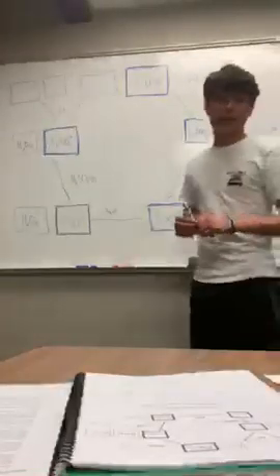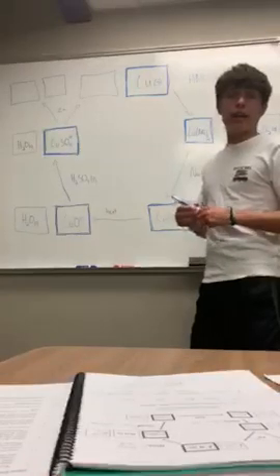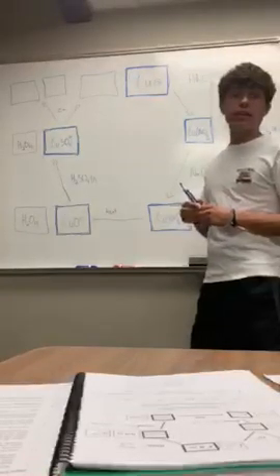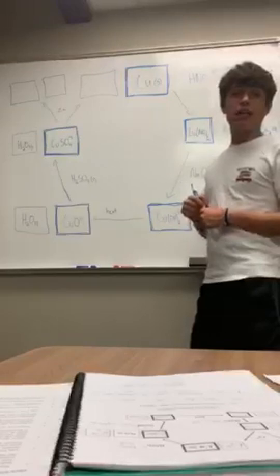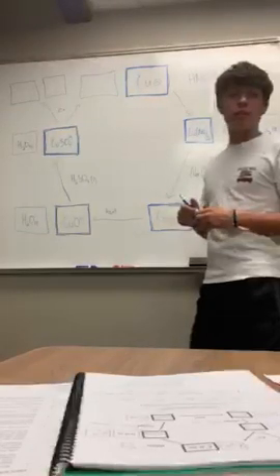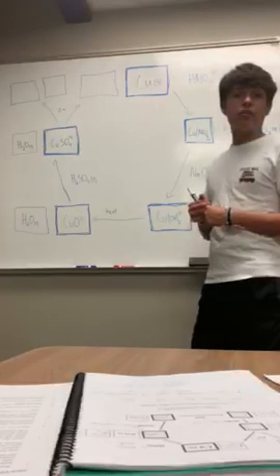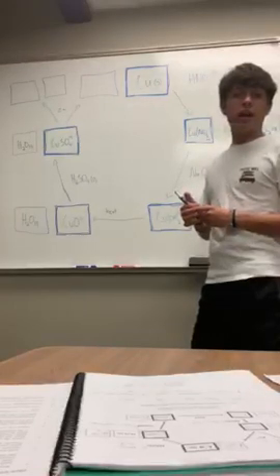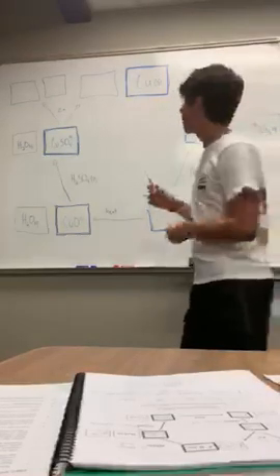And finally, granular zinc metal was added, and the zinc immediately chunked up, and the liquid solution got lighter and lighter until it eventually became clear. The zinc started to fizz and steam and turned reddish brown and into a solid and back into copper.